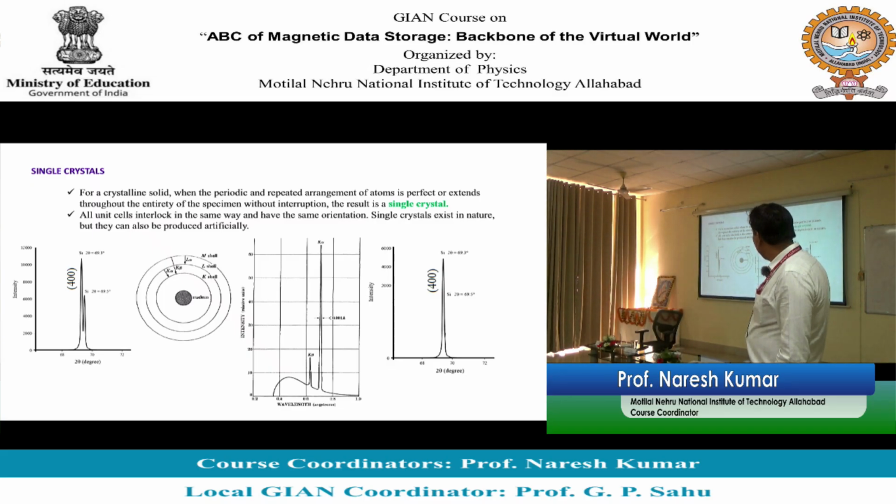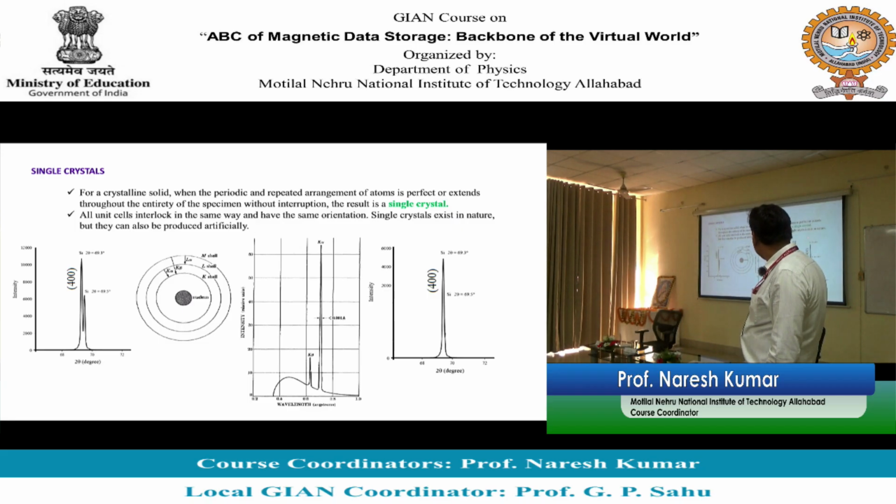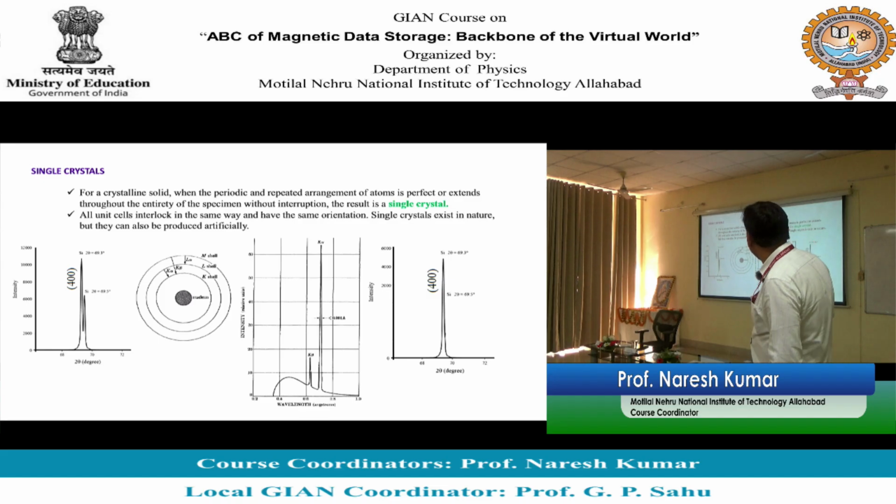या फिर ध्यान दीजिएगा, a single silicon single crystal I am taking. If it is a single crystal, I am getting 2 peaks. ये 2 peak कहाँ से आ रहे हैं सर? This is K alpha 1, this is K alpha 2. ठीक है ना? और वैसे भी पता समझ में आता है कि इसकी intensity is almost half. If you want to see just 1 peak, what you are supposed to do? आपको इस k-alpha 2 को भी हटाना है. So this is the peak after filtering k-alpha 2. Intensity will go down like anything. देखो कुछ 12,000 यहाँ बचती है, कुछ 6,000 के आसपास बच जाती है.